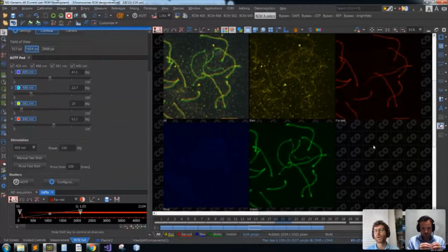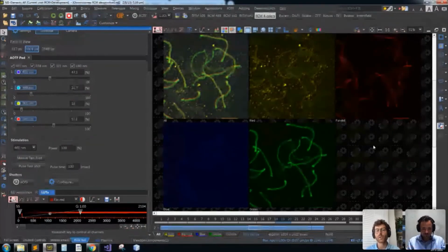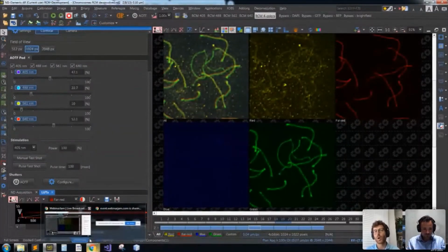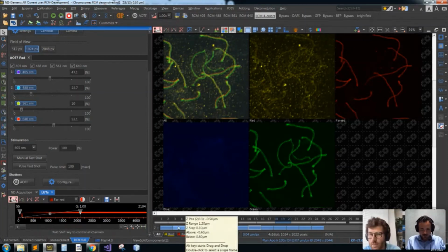It's maximized with factor 2. If we go further away, if we go faster, sorry, the motion blur takes over and then decreases the resolution. So square root of 2 raw data set is the best we can do. And that brings you then to 170 nanometers raw and 120 nanometers after deconvolution.